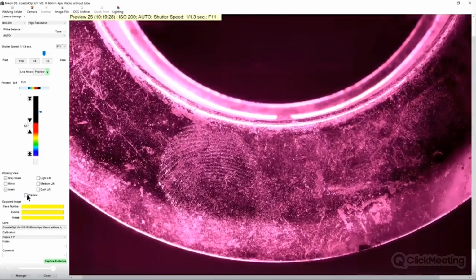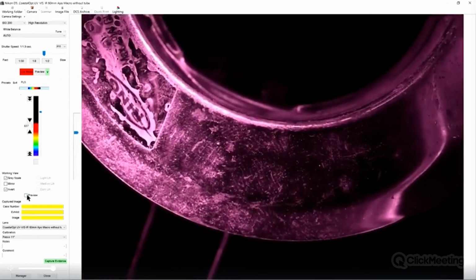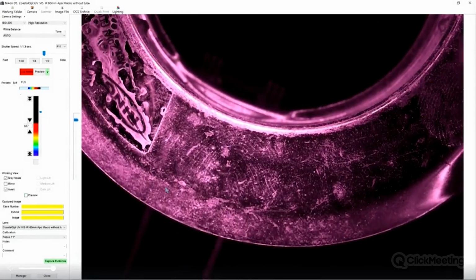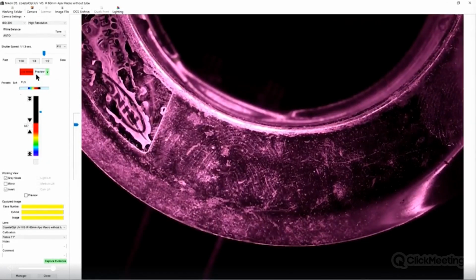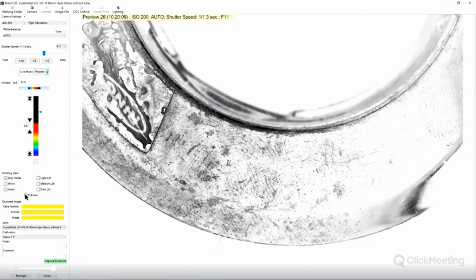If we actually move the brass lighting around, so we'll go back into live view mode, we can actually see another fingerprint a bit further along, and we can even see the core in the centre of the finger mark here. We'll just adjust our light, take another preview, and there we have our second finger mark.